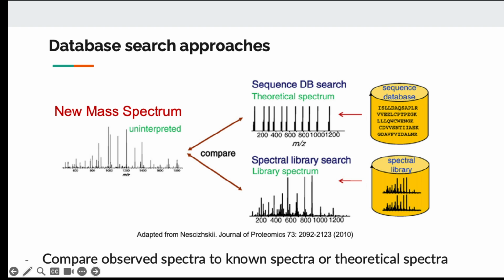But you have to go through this for all the possible proteins and peptides. Each one, you generate the expected spectrum, and then you compute the similarity between the two. It's a very brute force process, but it gets the job done. You can interpret your spectrum by asking which possible protein and peptide produce the theoretical spectrum, the expected spectrum, that matches my observation.